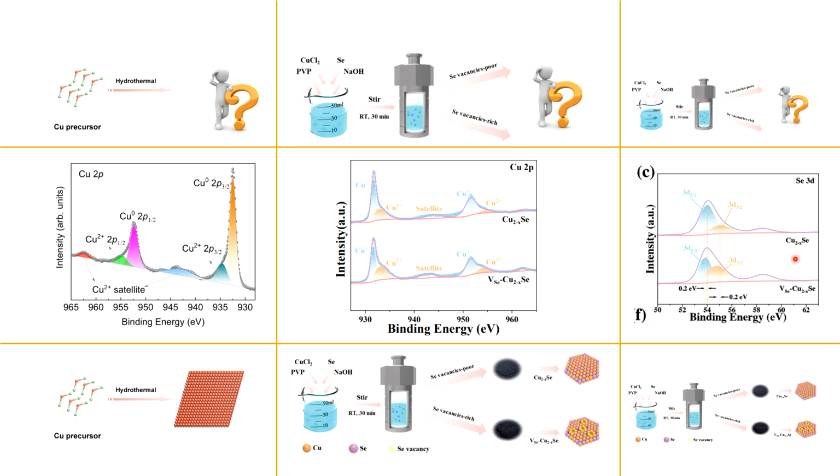There is more probability of that because there is no vacancy. And because of the more probability of being surrounded by selenium atoms, this selenium will have less electron density, because more electron density will be extracted by the other selenium atoms.